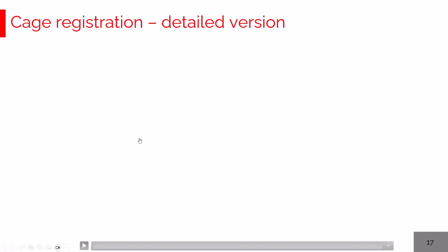So this is our light version in the sense that you really don't need to do anything more than clicking how many animals and adding how many animals in the cage are present. Obviously, you are losing any potential connection to your existing AMS, if any, or to your existing way of naming cages, if any. But if you don't have a real tracked version for cage names, this could be a nice alternative. Vice versa, if you want to have a more aligned approach to an already existing but not integrated AMS, we have a so-called more detailed version. Let's have a look.